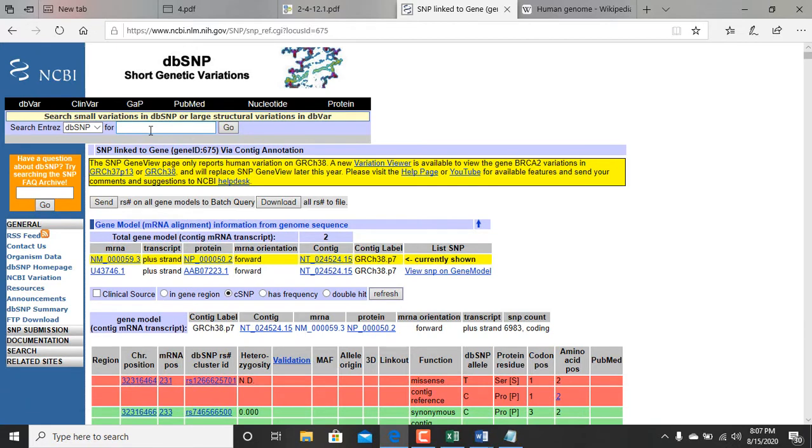To show me the SNP of that particular gene I have to search it myself, so let me paste that same gene and click on search.